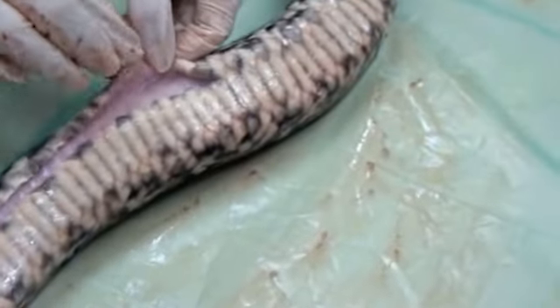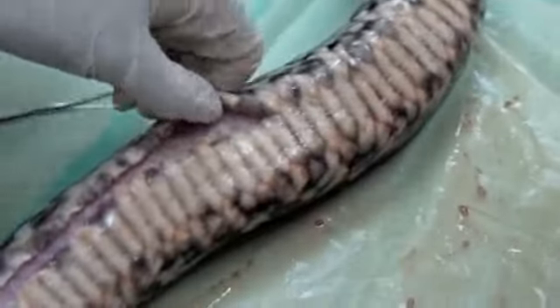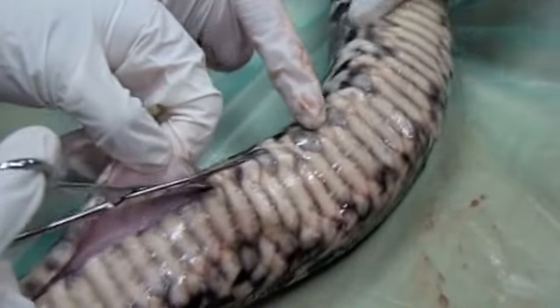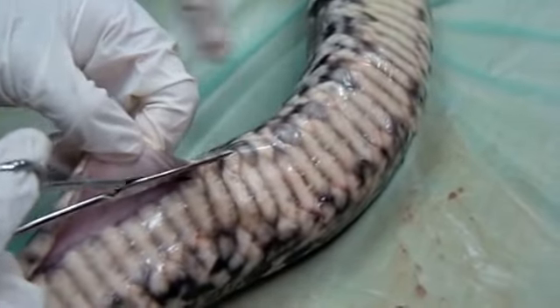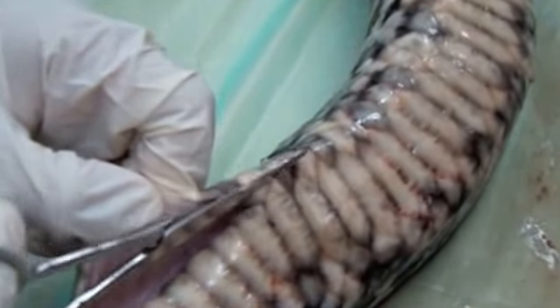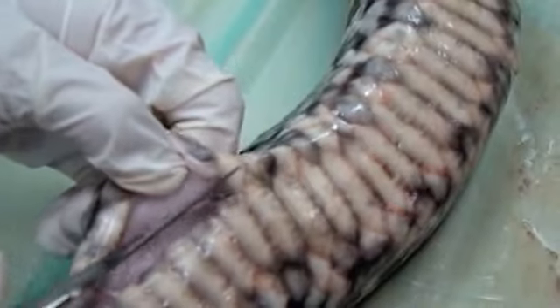Yanshu just said that it's hard to cut. Who else wants to cut? Okay, let her go and then you can go next. Be real careful to stay on this side. Don't go into the white, so come over just a little bit. And she said it was kind of tough to cut.